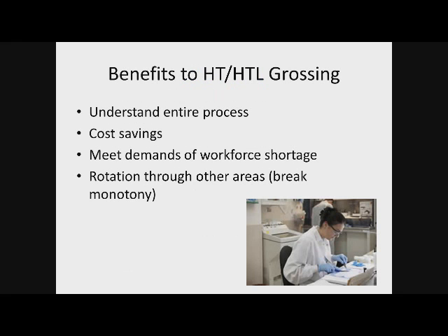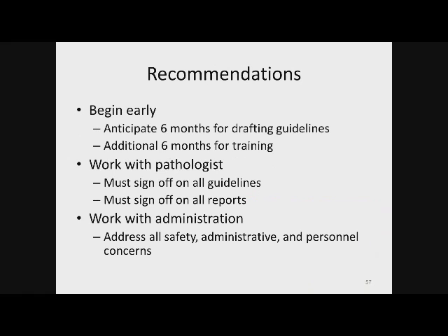So to summarize some benefits for HT grossing, the HT understands the entire process from when it's removed in surgery to the processing, the embedding, the staining, the cutting, etc. It can result in cost savings for the hospital. It can meet demands of a workforce shortage. There are currently only 7 PA training programs in the United States, so they're in high demand. It also allows the histotechnician to rotate through other areas instead of just cutting or staining or embedding.